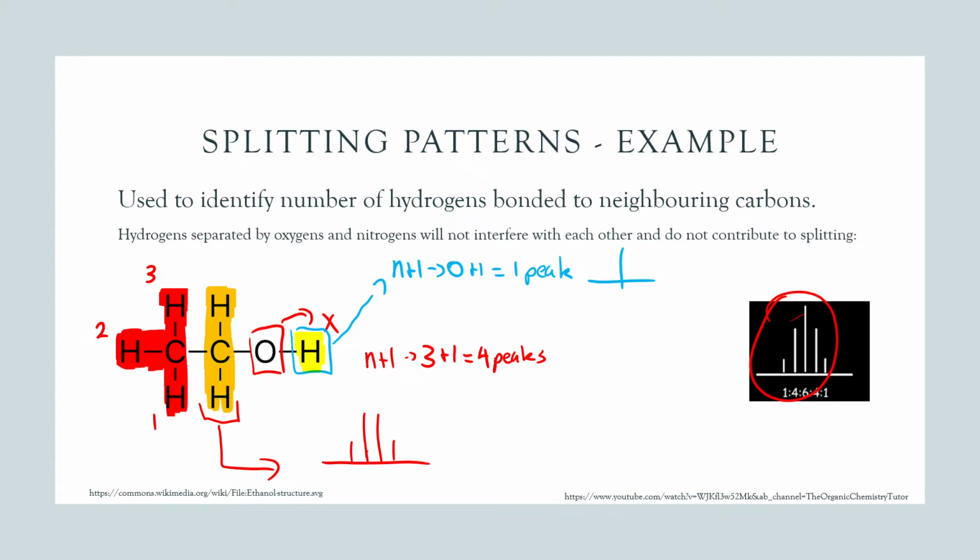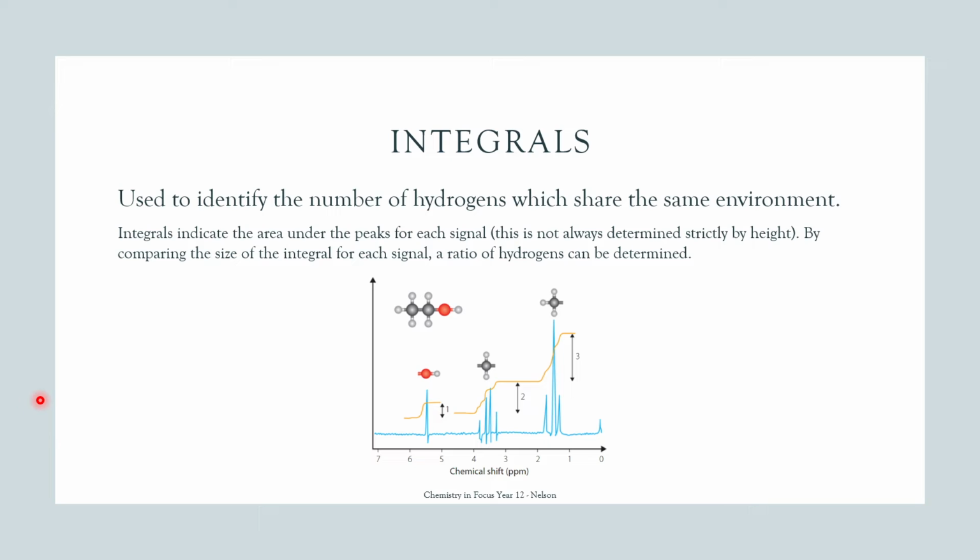Again, this is only the first time that you've been exposed to splitting patterns and how they work. If you're looking at this and it's all still a little bit confusing, come to class, ask some questions, we'll do some practice, and hopefully it will make sense quite quickly. Last thing I want to talk about is integrals, and we can use that to figure out the number of hydrogens which are in the same environment.